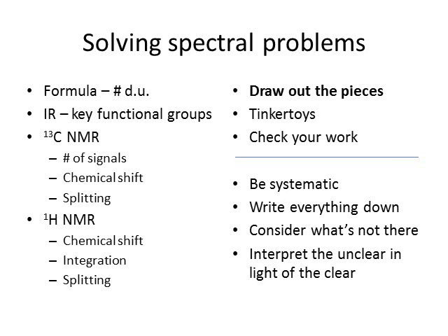I know, for instance, that carbon makes 4 bonds, that hydrogen makes 1, that oxygen makes 2, nitrogen 3, etc. And so if I have a CH3, I've got sort of an empty spot where I've got one more connection I can make. If I have a CH2, I can connect 2 things to that. If I have a CH, well, I need to account for 3 more connections.